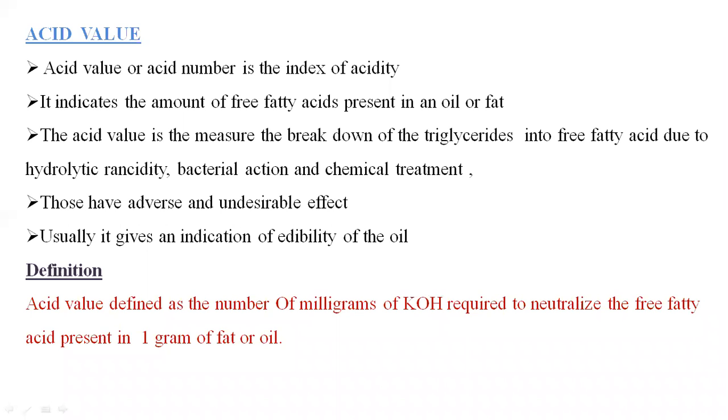The acid value measures the breakdown of triglyceride into free fatty acid due to hydrolytic rancidity or bacterial action and chemical treatment. So because of rancidity, the fats undergo hydrolysis, and then produce some amount of free fatty acid and glycerol.